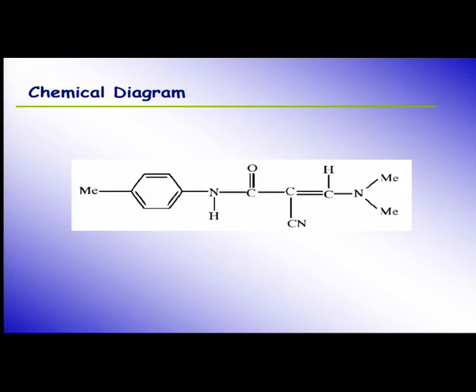Now, the chemist knows the formula. Even if it does not give you the formula, you can get the structure, no problem, by looking at the bond lengths, single bond, double bond and so on.